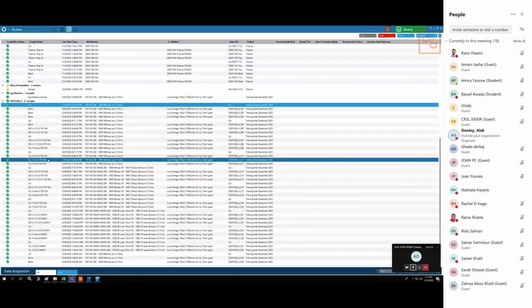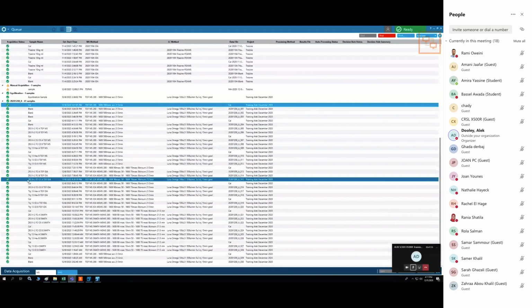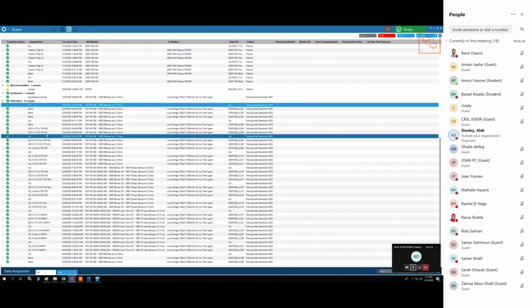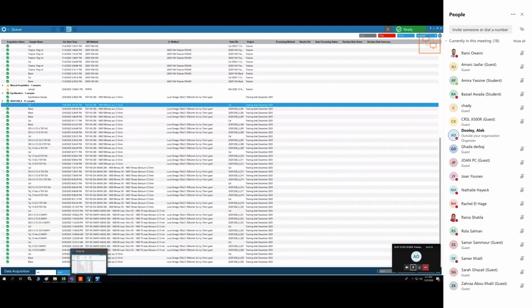It could be that previously you were washing with a stronger solvent and it somehow got into the flow path and it didn't equilibrate itself out. Let's look at the retention time from this sample, which is early, very early, and we'll see. Okay, so this is good.